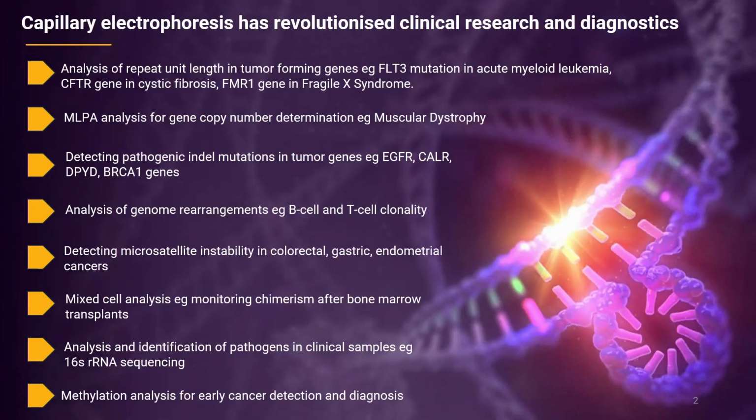Okay. Capillary electrophoresis has revolutionised clinical research and diagnostics over the last couple of decades. Its applications range from diagnosing diseases, assessing disease risk, monitoring chronic conditions, and all the way through to personalising medical treatments. You can use fragment analysis to detect mutations in a wide variety of genes.